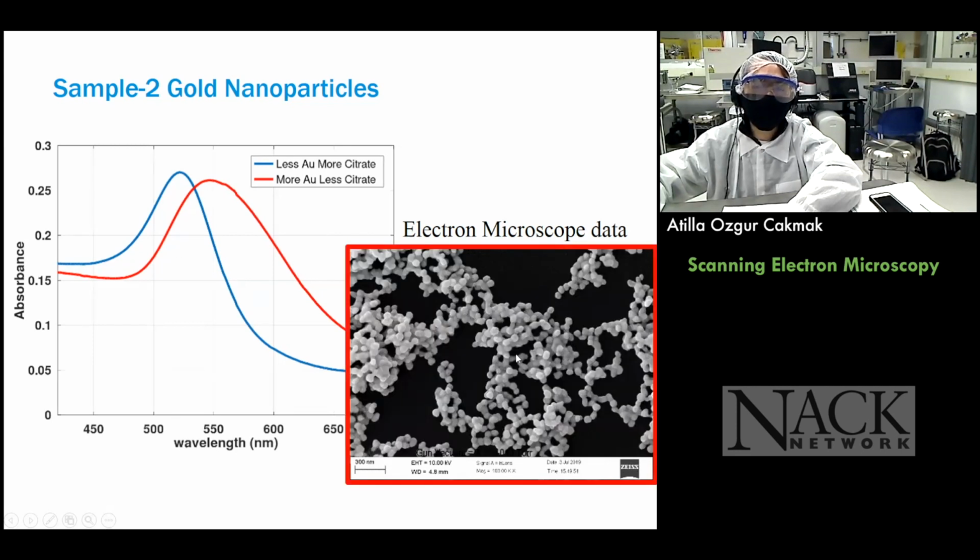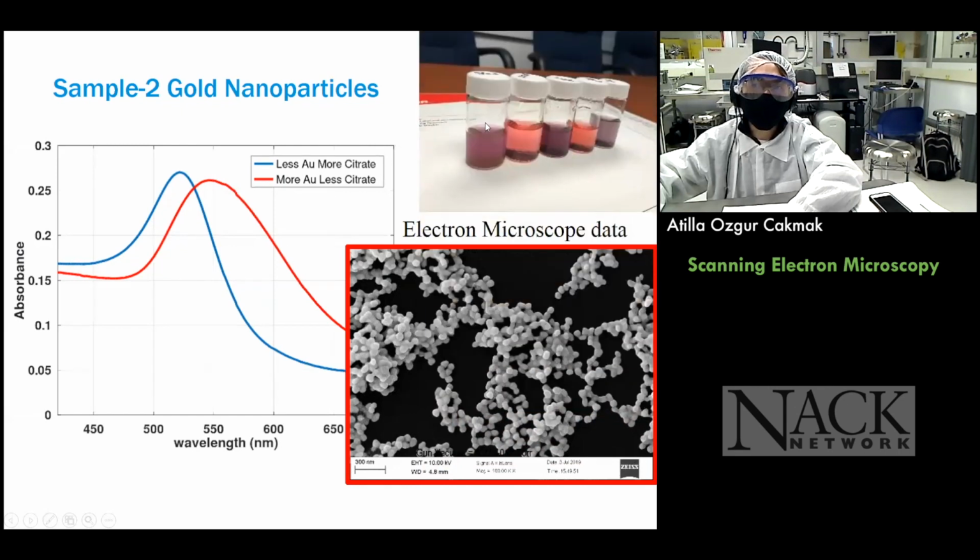When you create larger nanoparticles, they resonate at larger wavelengths, like you can see. And all that light energy is going to be transformed into heat and will be transformed into absorbed light from the incoming light power. So my students actually created these different nanoparticles, and you can vividly see the different color formations here too inside the glass vials.